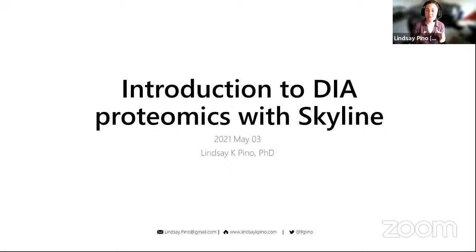And especially, I'm going to be trying to frame these within this software tool called Skyline. So we're going to have some hands-on with Skyline later. Try to download those files if you haven't already. And hopefully the TAs can help you get set up if you're having issues installing Skyline.